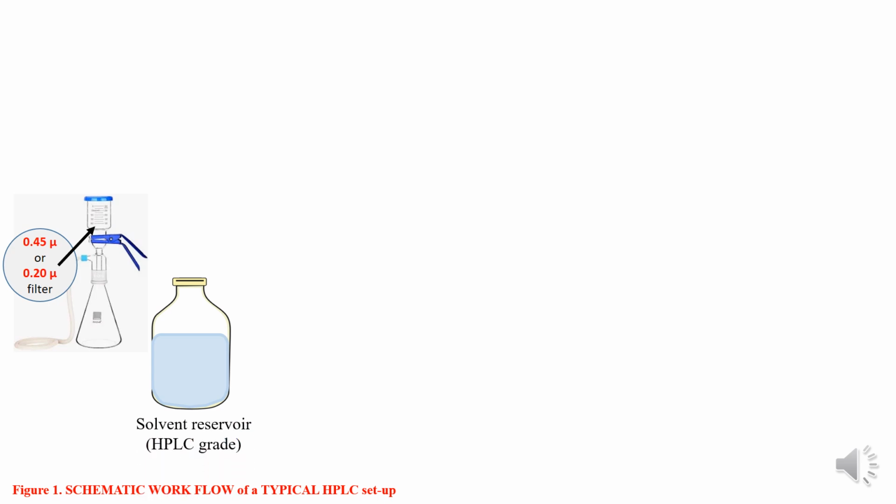Now the solvents used for the HPLC technique should be of analytical grade, and HPLC solvents are commercially available. Some of the polar HPLC solvents that are commercially available are water, methanol and acetonitrile.